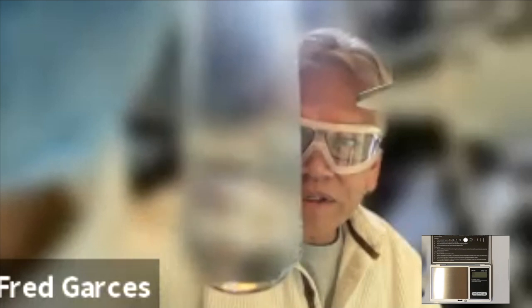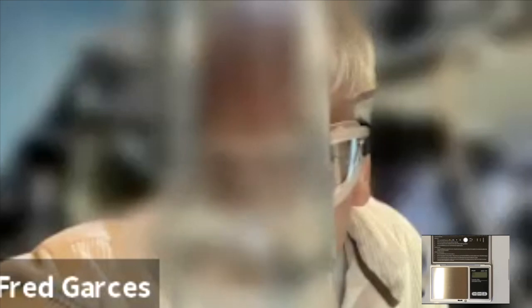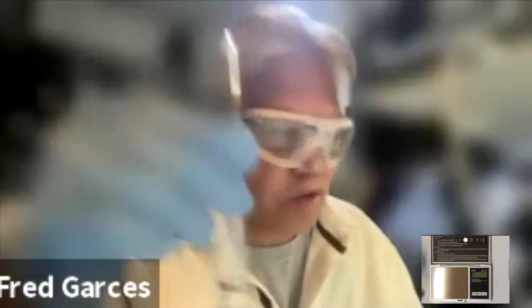And you can just barely see the three layers there, but you should have 3 layers if you do this right. The most dense on the bottom, the least dense on top. I apologize. My computer camera keeps wanting to focus, but you get the idea. You have the 3 liquids.